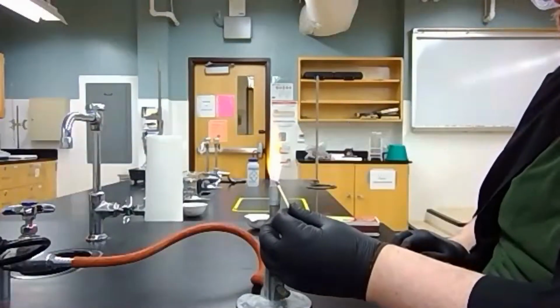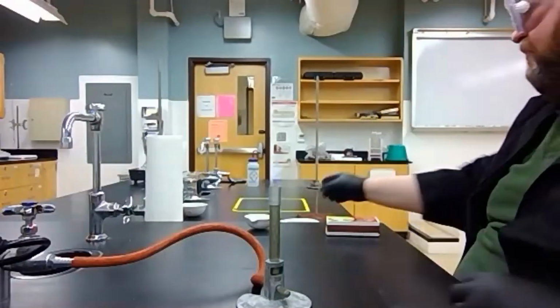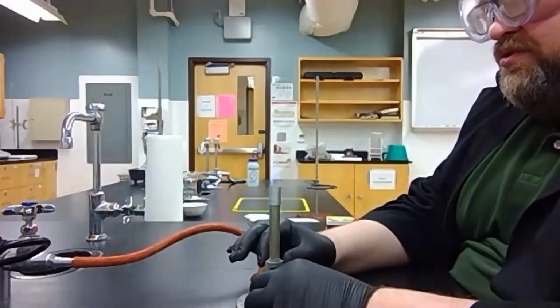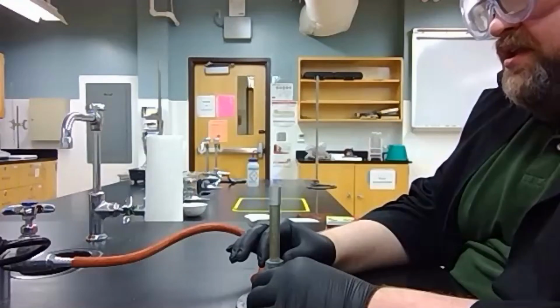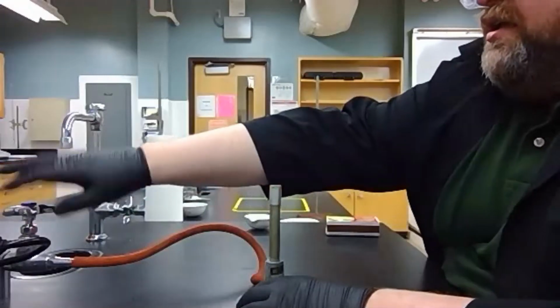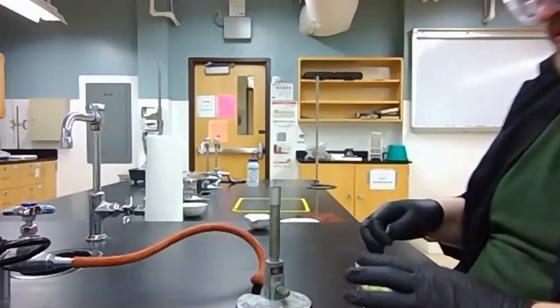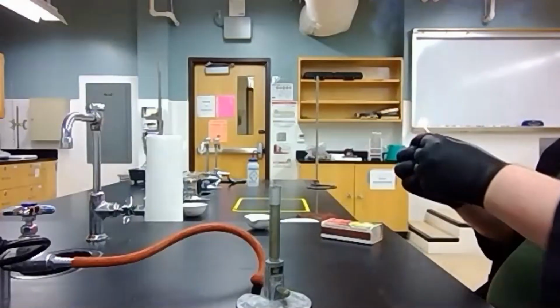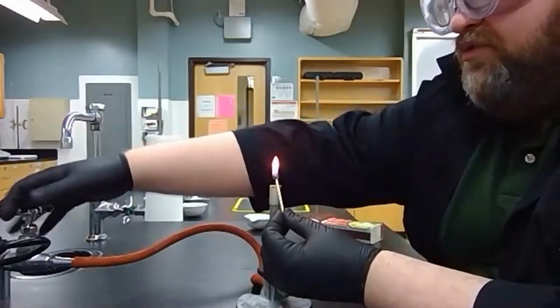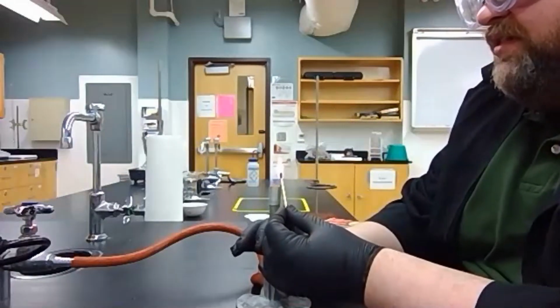Okay? Now, as you can see, we now have a wonderfully lit fire. Okay? So, to perfect this, I'm going to close down the gas just a little bit to give us a little bit more stability, and I'm going to open the air a little bit and completely lose my fire. This is more art than science. Don't be afraid if a Bunsen burner takes you 2 or 3 tries to light. It's okay. It's fine.